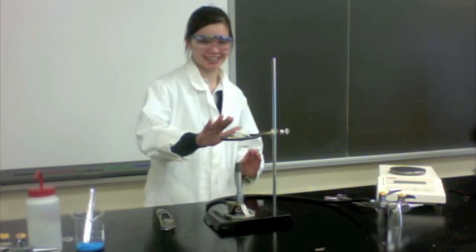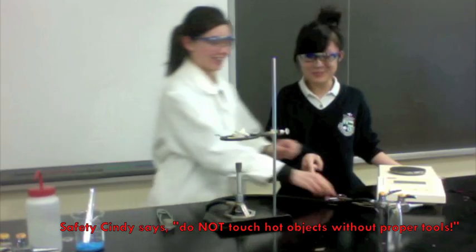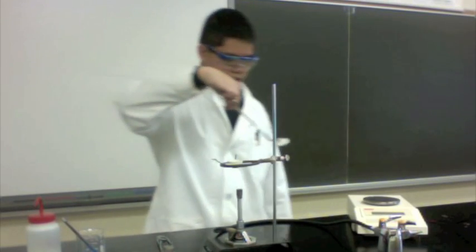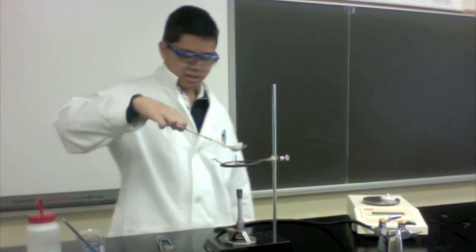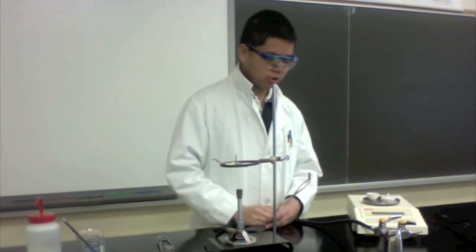After heating the crucible for 3 minutes, we are going to allow it to cool down for another 3 minutes. Safety Cindy says: don't touch the crucible — it's hot! Use the crucible tongs! Now you have to weigh the crucible and the cover. Take the cover with your tongs and place it on the scale. Then carefully take the crucible with your tongs and place it on the scale as well. Wait for it to settle and record the given mass.